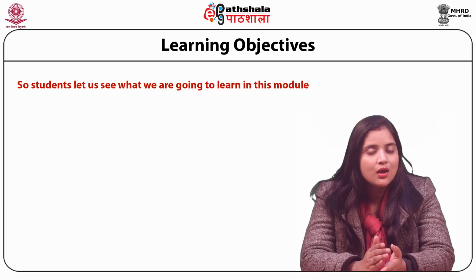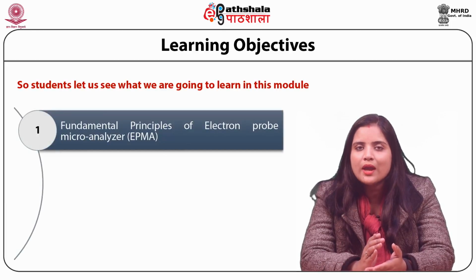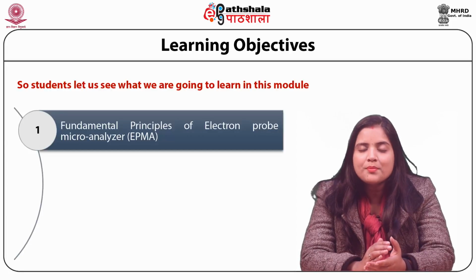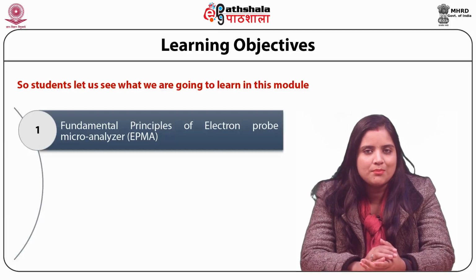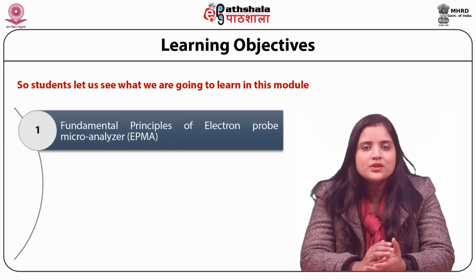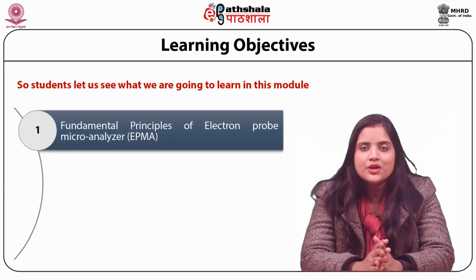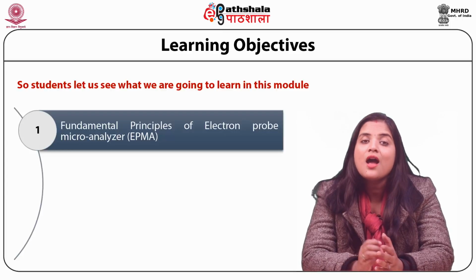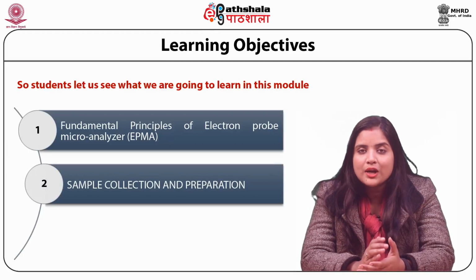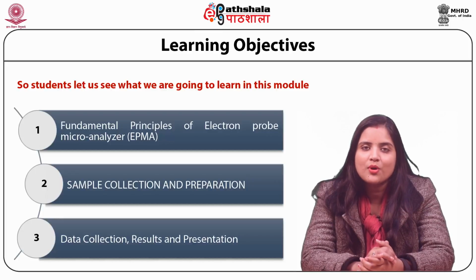In this module, the working principle of electron probe microanalyzer is described. Then, the instrumentation of EPMA is discussed in detail. After this, the limitations and strengths of electron probe microanalyzer are studied. The sample collection, preparation, and data collection is also described in this module.